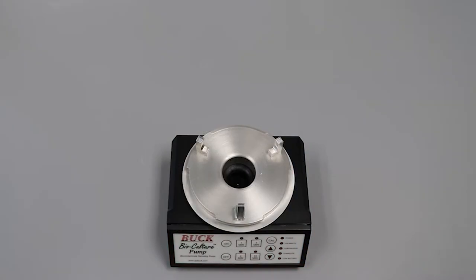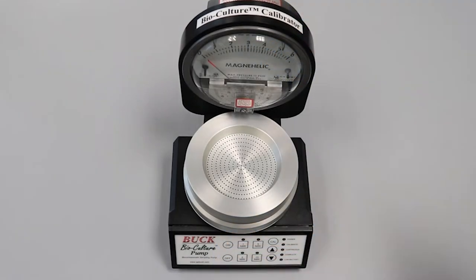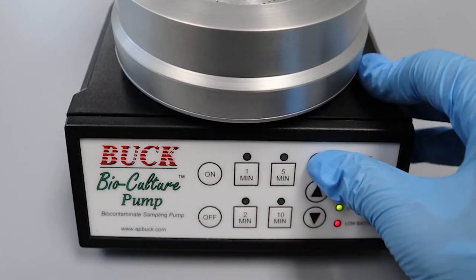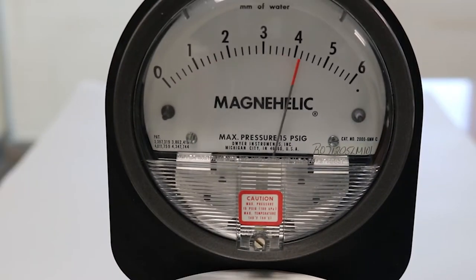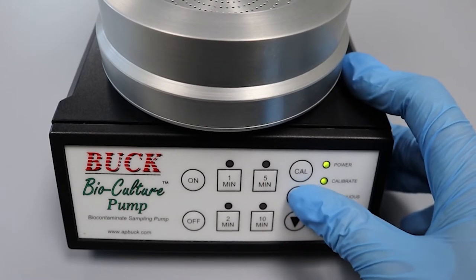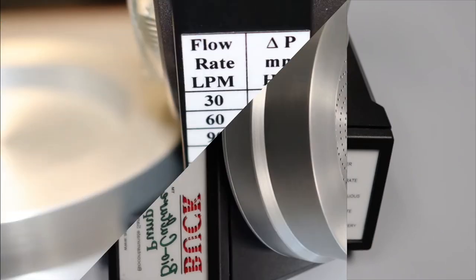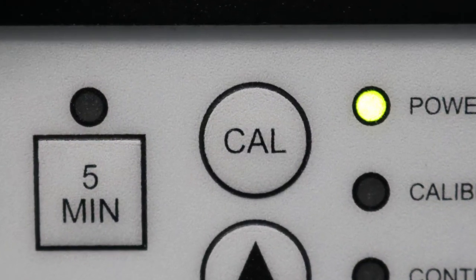The pump should be calibrated before each sampling. To calibrate, screw the calibrator with the attached head and pressure gauge onto the pump. Push on, then press CAL for two seconds to put the pump into calibration mode. Adjust the flow rate using the up and down keys to the desired millimeter of water pressure to achieve the correct flow per minute. Correlate with the calibration chart on the side of the gauge. When the flow rate is achieved, push CAL to accept the setting.